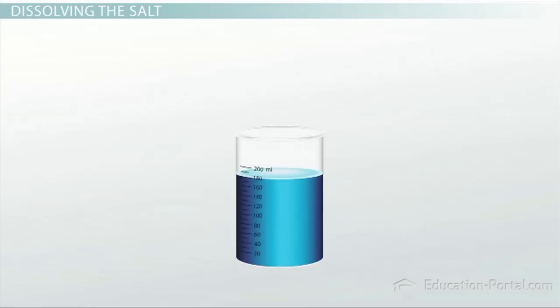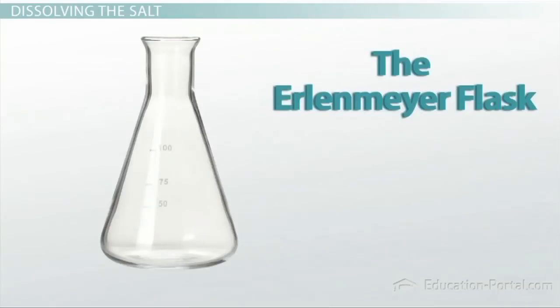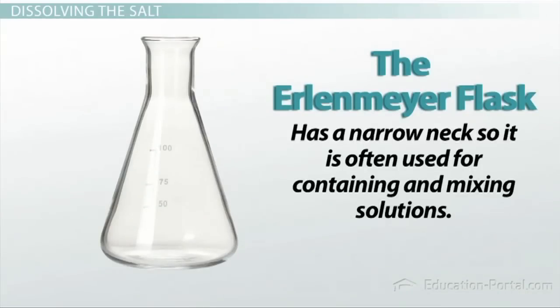While we are stirring the salt and water, we notice that some of it splashes out on the sides. We don't want to lose any more of our solution, so we're going to transfer it to a better piece of glassware for the job, the Erlenmeyer flask. The Erlenmeyer flask has a narrow neck, so it's often used for containing and mixing solutions. It's very convenient to dissolve solids using these because the narrow neck allows you to swirl the liquid without worrying about it spilling or splashing out.